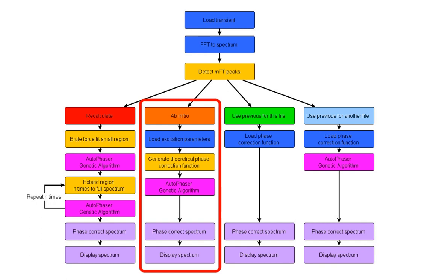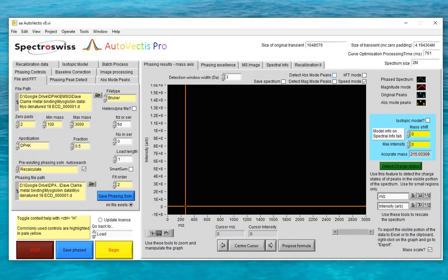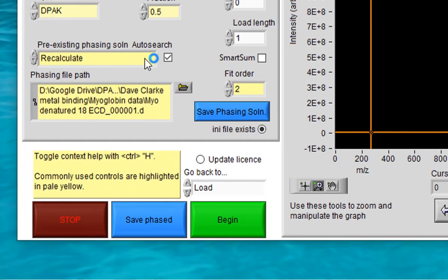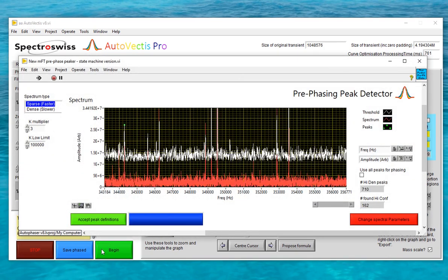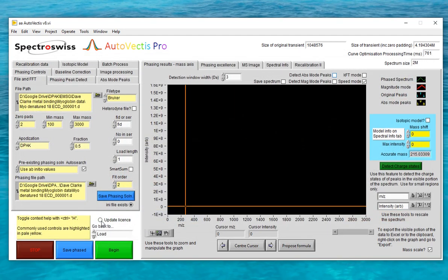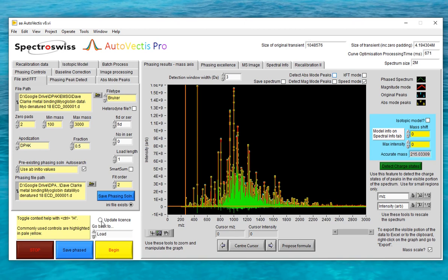It all probably sounds quite confusing, but in practice the whole process for producing an absorption mode spectrum by this route is almost completely automated, and it is in fact much easier for the user than going through the Recalculate route. To activate ab initio mode, you just select it using this control and then hit begin as normal. You still need to choose which ions to use for phasing, the same as you would for the Recalculate mode. But then the rest of the phasing process is completely automated. The only point of manual input is when you need to accept the selection of peaks to be used for phasing, and by and large Autovectus will do that correctly for you as well.